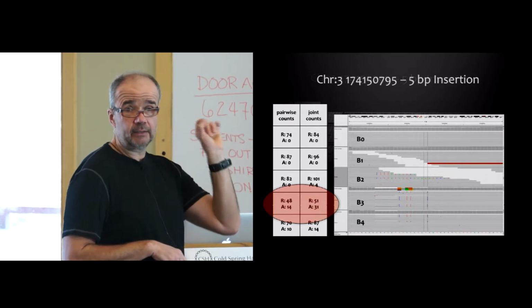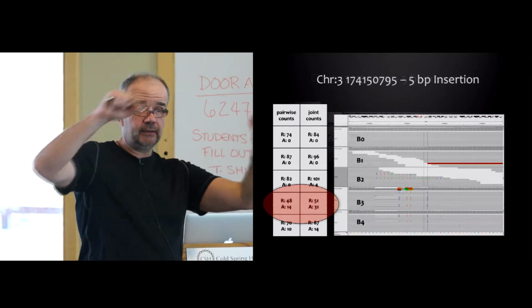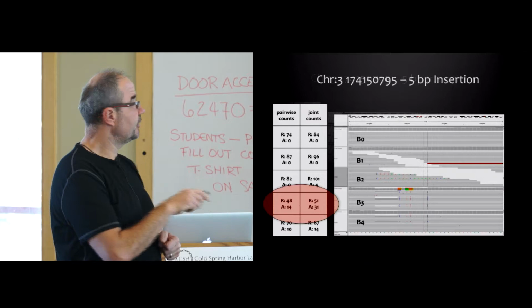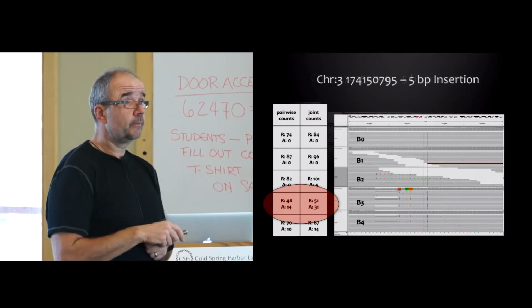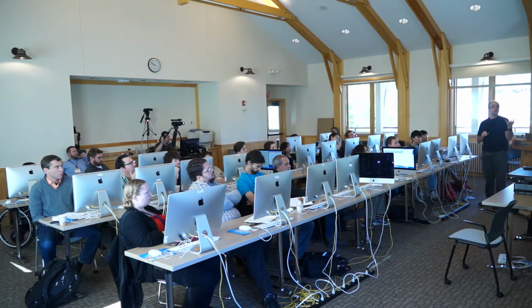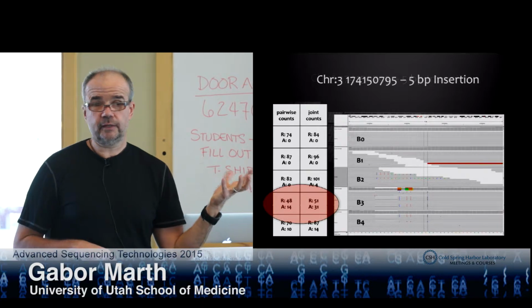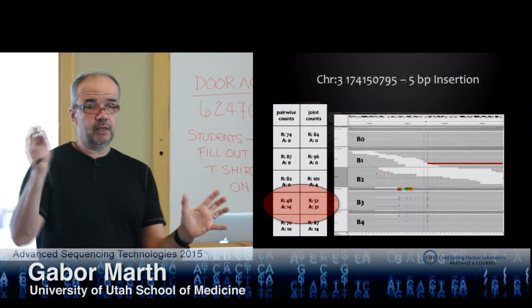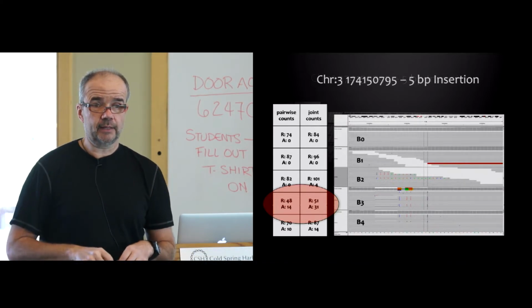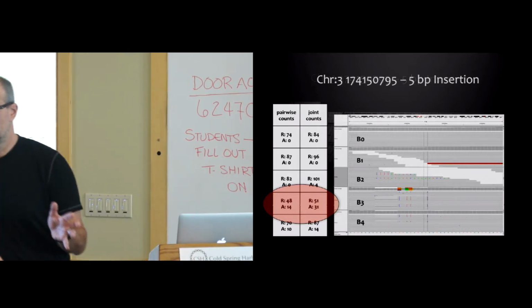When we went back with this graph method and offered the alternate allele as a branch of the graph and mapped all the reads back to it, we fished out an additional 17 reads. So this means that now the frequency of that allele became double what it was before. Okay, so this is a significant change. Now that variant will be clustered somewhere else, and it belongs to a different subclone than what we originally thought.